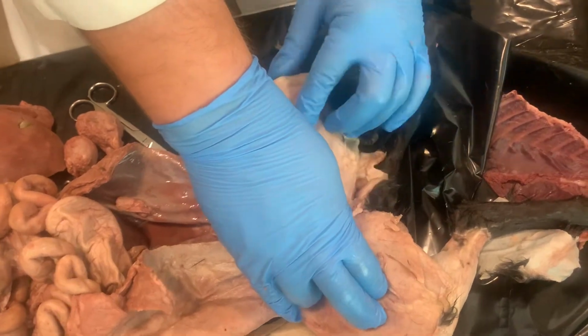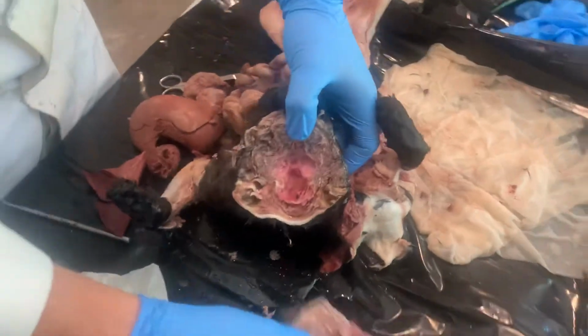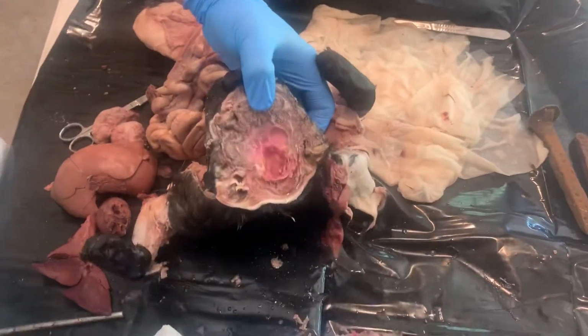Okay, this is also a male, not dissected out quite as much. You have your scrotum and your penis. You have a coronal section here where we cut off the top of the head. Coronal section.